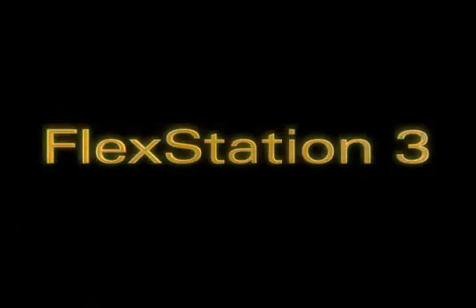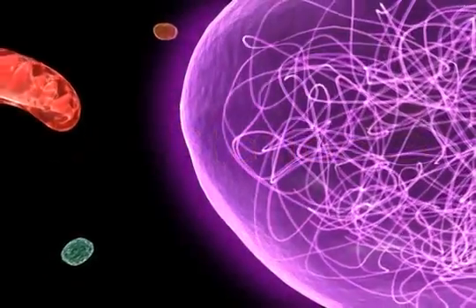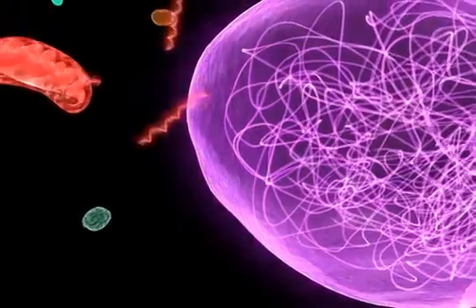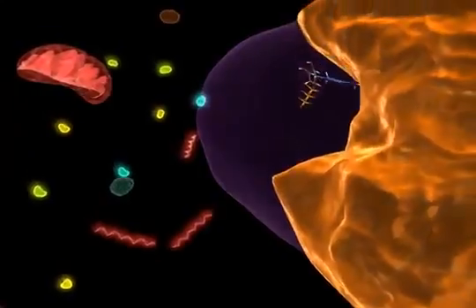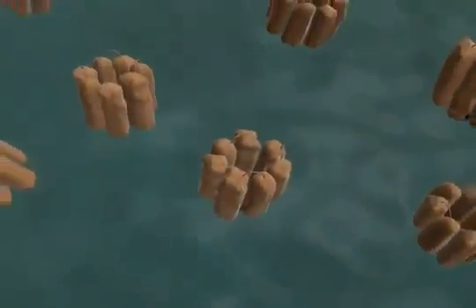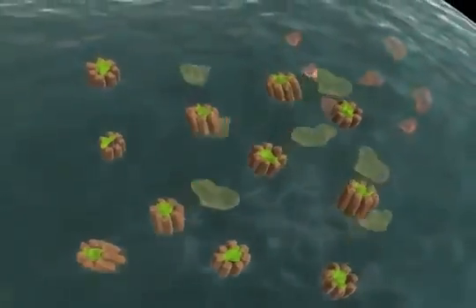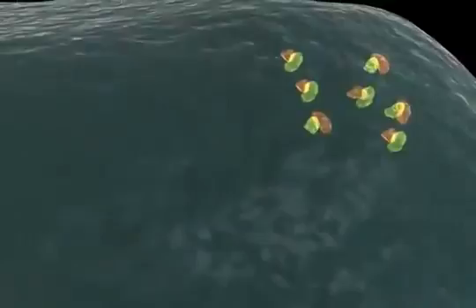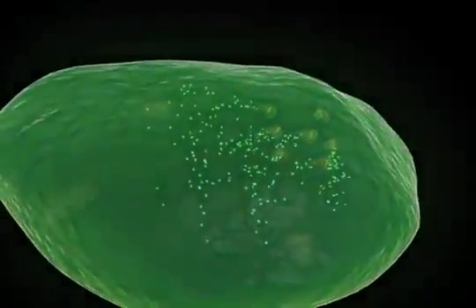Multi-mode detection systems enable a wide range of applications for research, assay development, and screening within a single reader. DNA and protein quantitation, as well as enzyme assays, can be performed using your choice of detection modes. Fast kinetic calcium flux assays can be performed using the FlexStation3 system's integrated pipetter for detection of rapidly occurring cellular events.